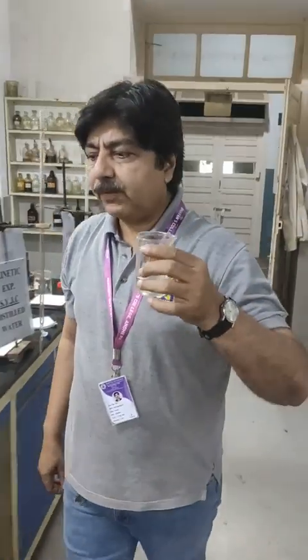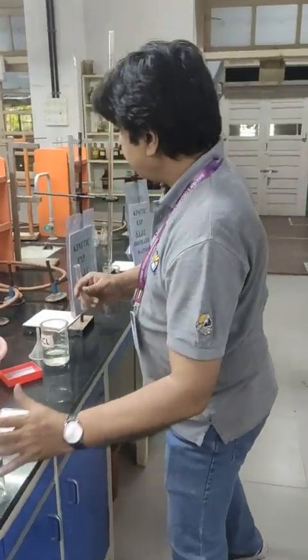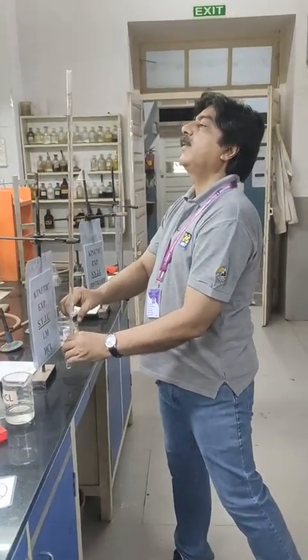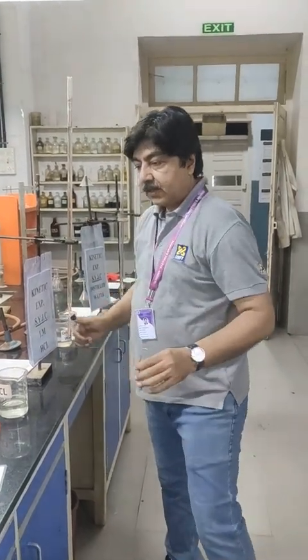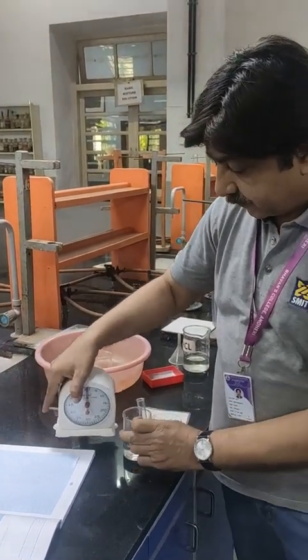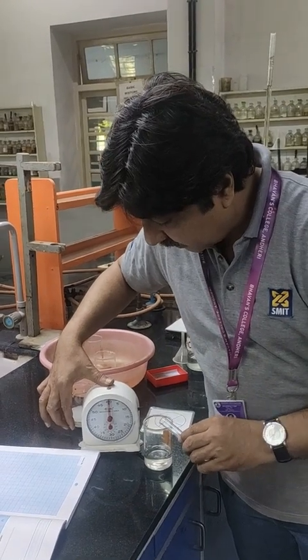I have added 18 ml of water, and now I shall add 2 ml of HCl. In the first case also we had taken 2 ml. In the second case also we are adding only 2 ml. Now I have already reset this watch. Now I will add and I will start this stopwatch.